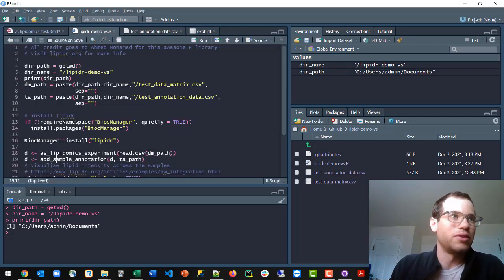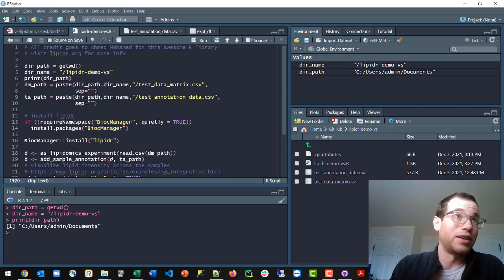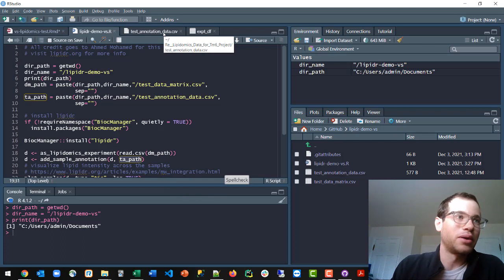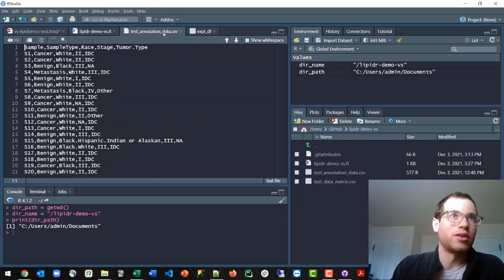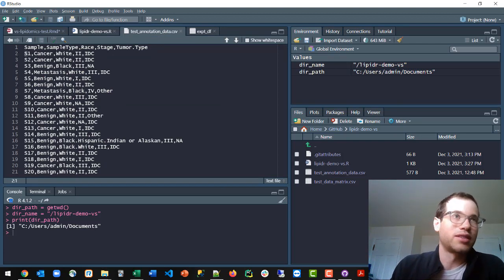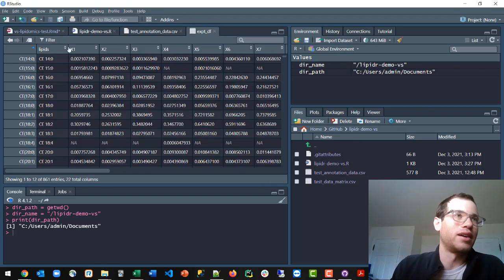And then you also need this sample annotation. So that's where this second CSV, the second input to the lipidr package comes in here. And that's basically the following, where we're specifying the characteristics of each one of these mice in our study.